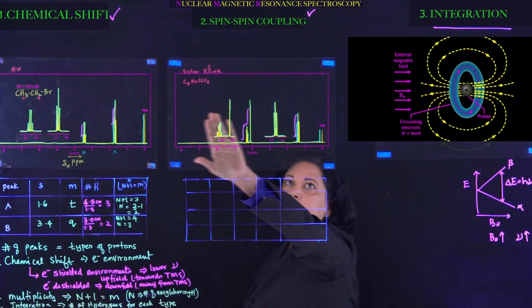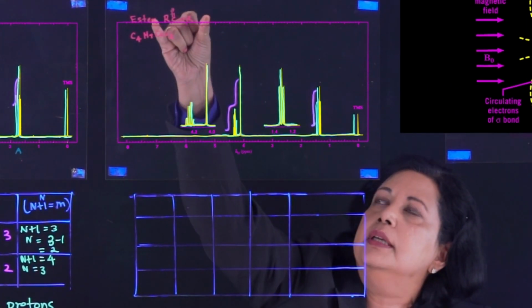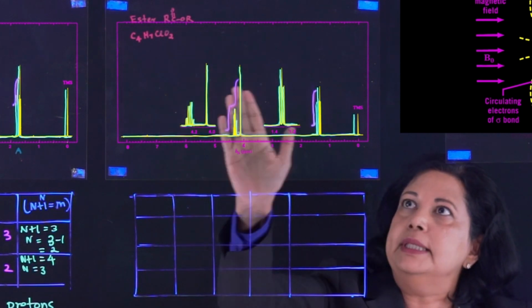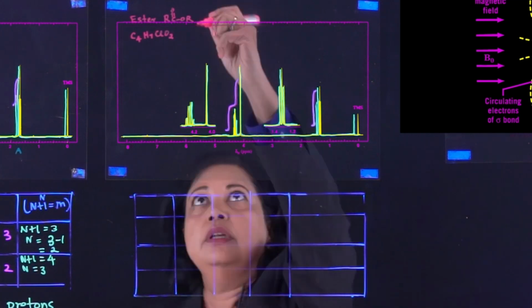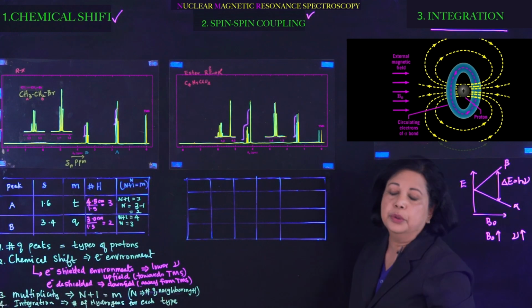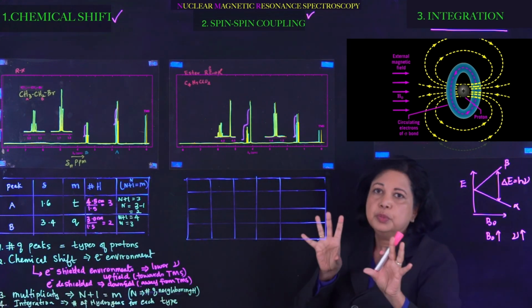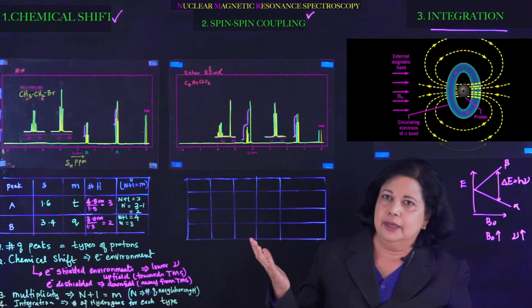They're telling us this is a spectrum of an ester. An ester has 2 alkyl groups that are flanking a carboxylate group, which is a C double bond O, O group. So this is going to help us then decipher the exact structure of these R's. And they may be different, they may be the same. We don't know. We just have to solve for it. Okay, it's a puzzle. So each NMR is nothing but a little puzzle. It's like a jigsaw that you put together the pieces, and then the picture pops out at you, or the molecule pops out at you in this case.